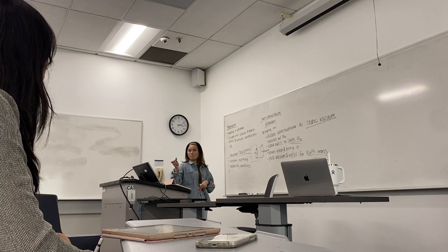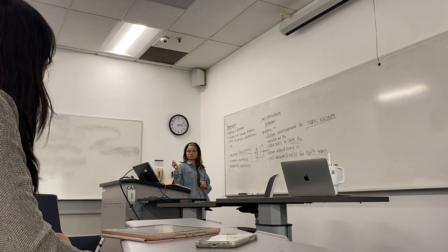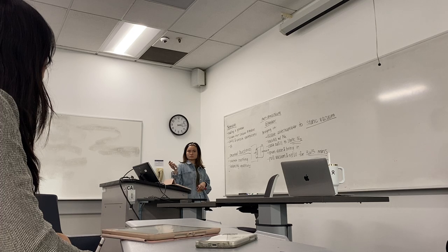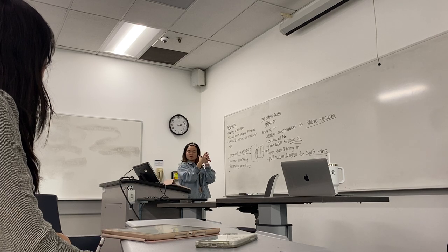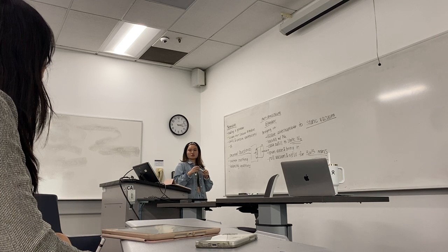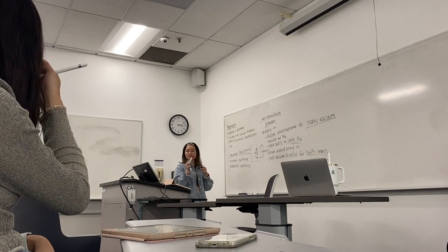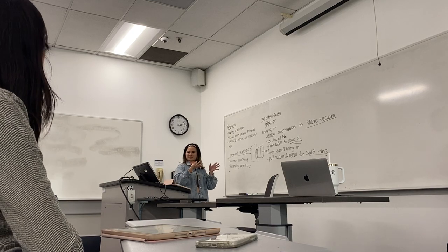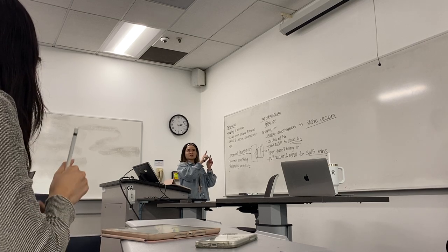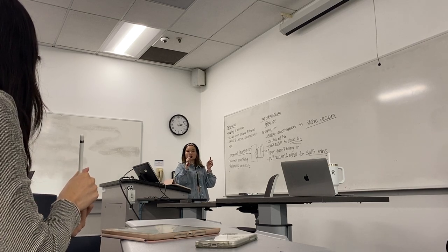I have a question. Say we're doing active nitrogen, we're pushing nitrogen out, right? But how can oxygen get in from it? Because you're taking nitrogen from the glove box itself. Oh, I see. So when you're pressurizing the port, it's from the glove box, not from an outer source. Yeah, but how can oxygen get in there? Because if nitrogen is leaving the glove box, then oxygen can get in.